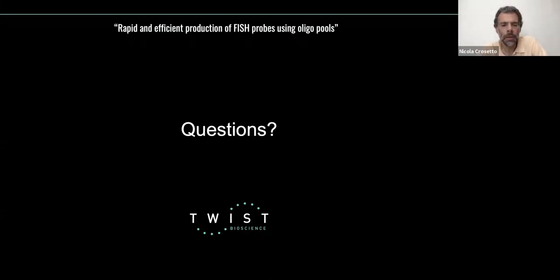That's a great question. We are obviously aware of that, and we want a broad community of people to benefit from this. So that's why we are now running our oligo design pipelines in order to design databases to start with for many species, all the most important model organisms. We have almost completed the mouse genome. We want to do zebrafish, C. elegans, and yeast. So stay tuned. Hopefully we'll soon be able to add our databases to the web tool.